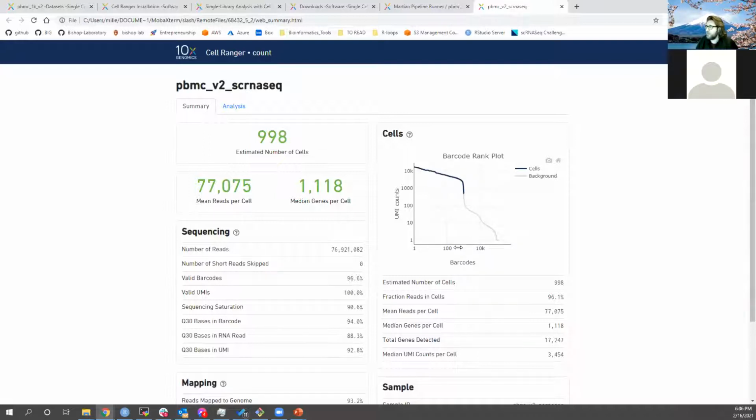And they ultimately decided from some other wet lab validation that they did that the correct place to make their cutoff would be just about here, somewhere in the middle of this curve like this. And this is probably the main way today that we decide what constitutes a cell and what constitutes just background noise. You don't have to follow their recommendation.